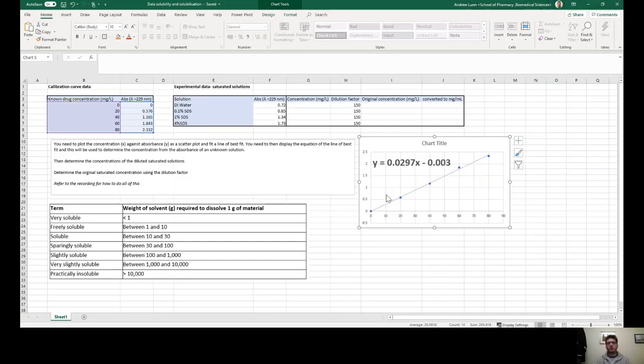Now this should go through the origin. That is just a little bit of error in our readings. And so I'm going to just ignore that and make it negligible. It is negligible, so we're going to ignore that. Now this maps exactly onto the Beer-Lambert law if we remember that the path length is 1 centimetre, but I've been through that before. So if you still want to go through the Beer-Lambert law and how that fits on, go back to previous things you've been taught from me.